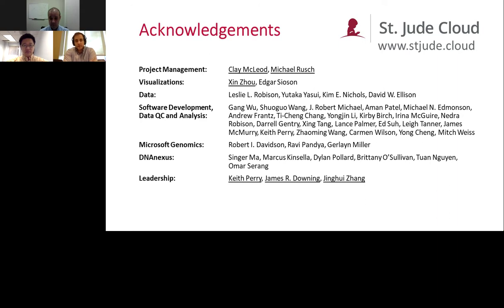So the Pecan Pie variant annotation tool, you can just upload a VCF and St. Jude will pay for that. So I think that's all of the things that cost money in St. Jude Cloud. Scott, can you think of any others?